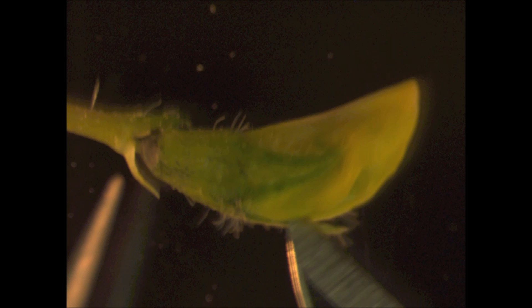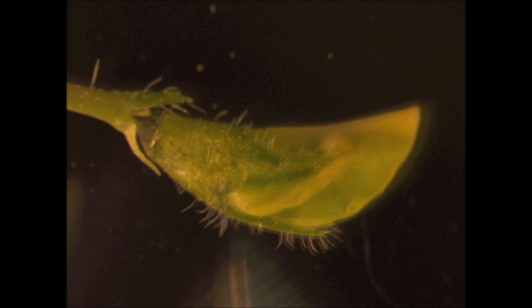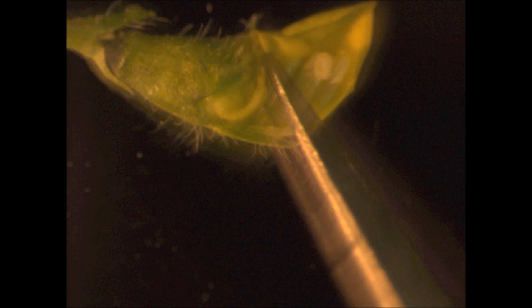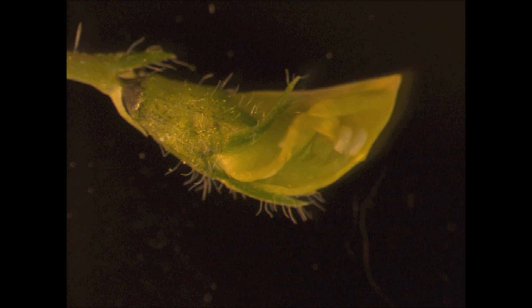To open the flower bud, stab gently on the keel petal at the bottom one-third of the flower bud. Then make an incision along the center line on the keel petal all the way to the end using a sharp scalpel tip. Using forceps tips, push the cut keel petal along with the standard petal upwards to visualize the anthers and stigma.